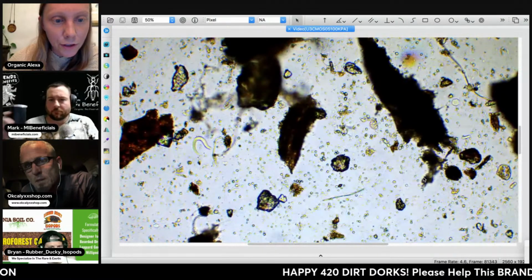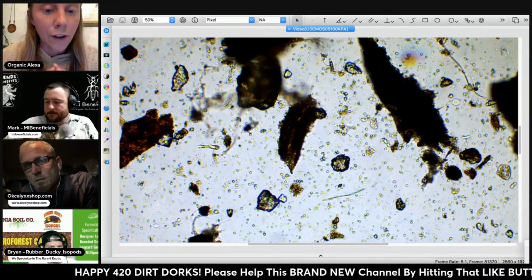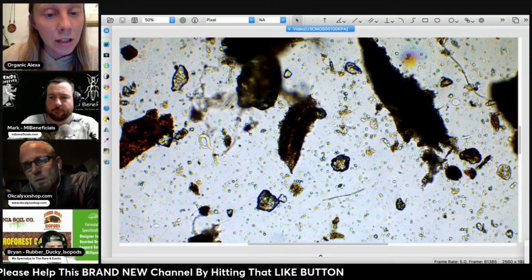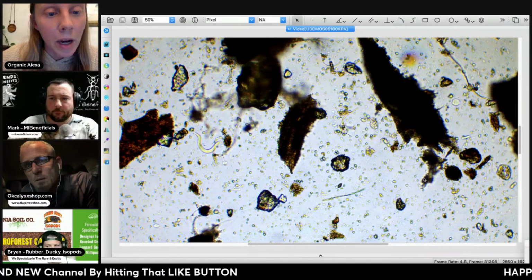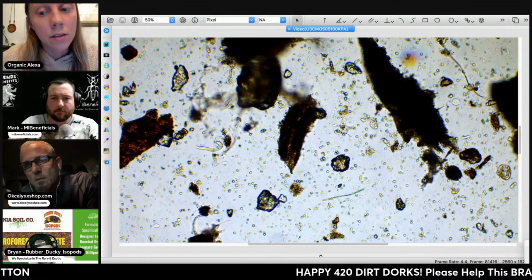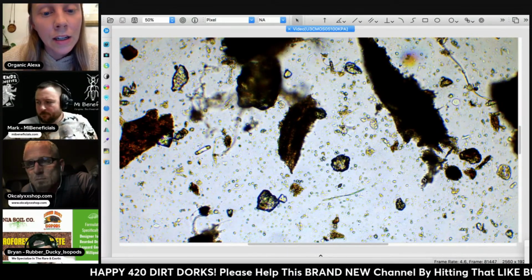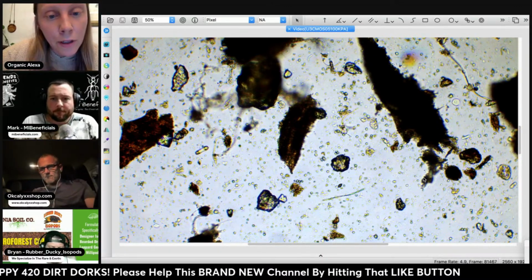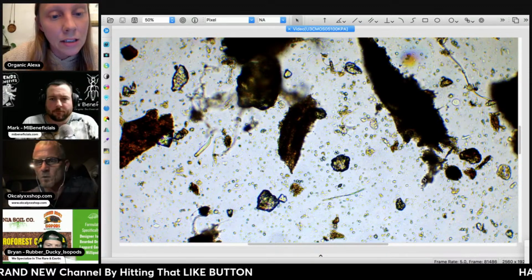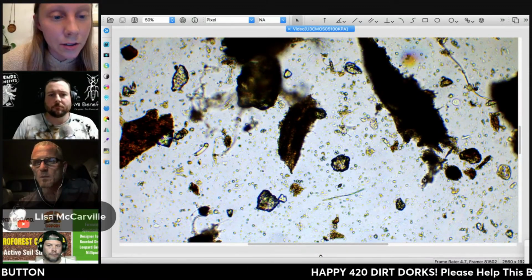Some of them have two different morphologies. When they're moving, they have a flagellated form, so they have a body, and then a flagella, which is like a string that they use to move. And when they're eating, they have an amoeboid form, which, like amoebas, has a squishy pseudopod body. They use that to phagocytize, so take in bacteria through their bodies.